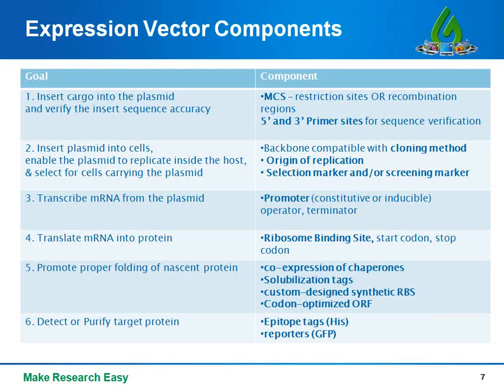Next, you're going to want to insert the plasmid into cells. For certain delivery methods, you need to ensure that your plasmid backbone is compatible. For example, for viral-mediated delivery, your backbone needs to contain components required for viral packaging. Then you need a way for the plasmid to initiate its own replication within the host by recruiting transcriptional machinery proteins. This is called an origin of replication.